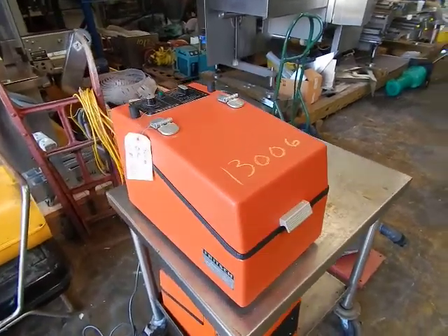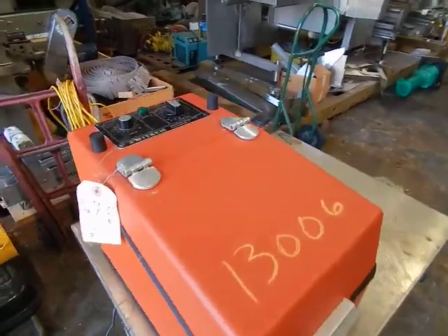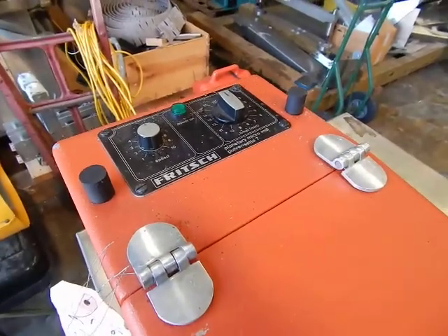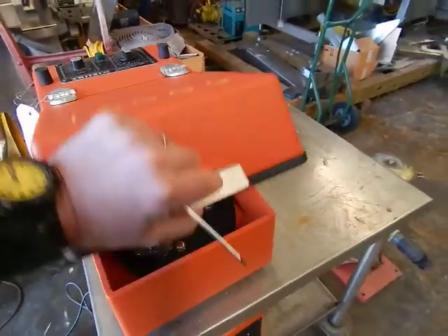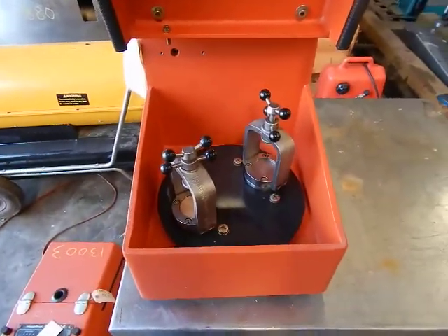We're demonstrating a Fritsch Pulvisat 7, what they call their micro mill. It's powered up right now. The unit operates off a timer with variable speed control, and internally has two stations which revolve and rotate.